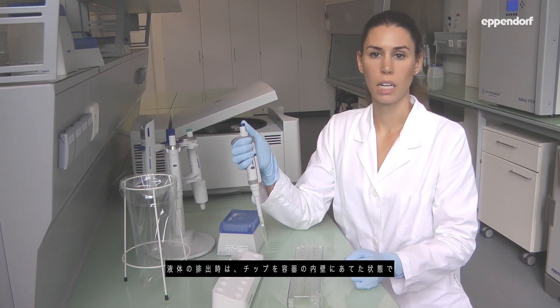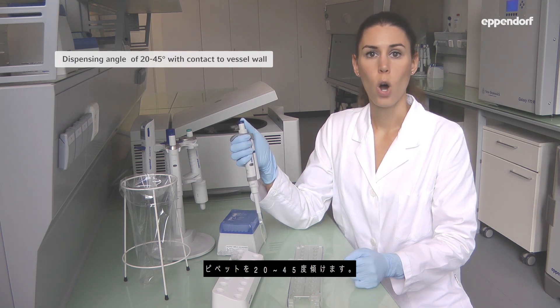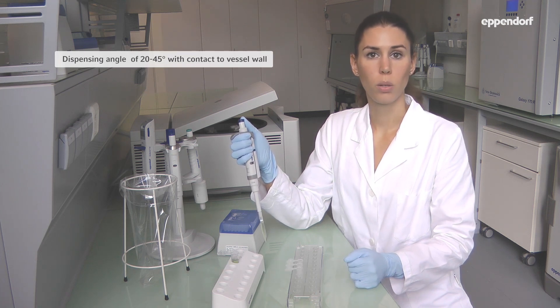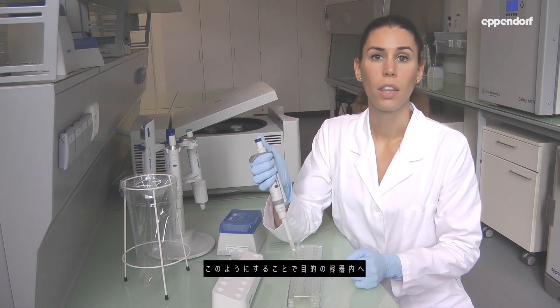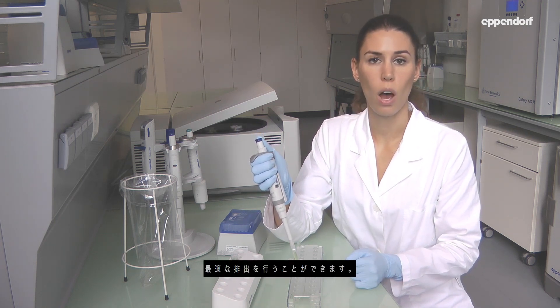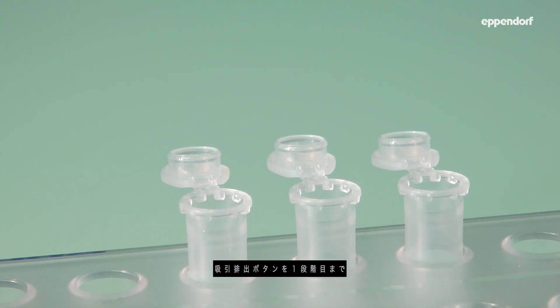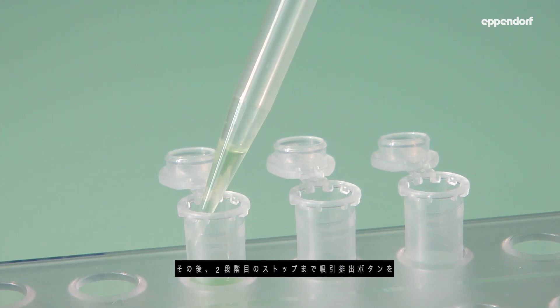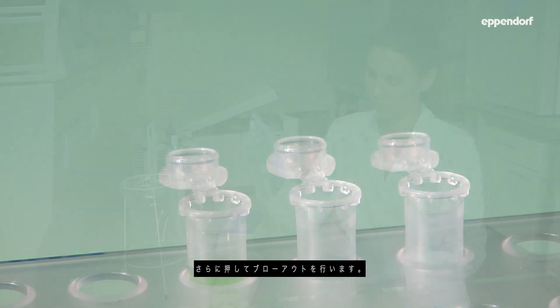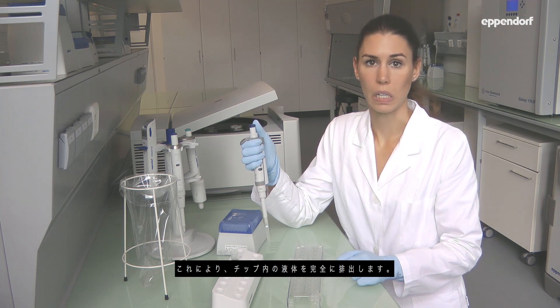When dispensing liquid, the angle of the pipette should be between 20 and 45 degrees, whilst the tip should stay in contact with the vessel wall. This guarantees optimal flow of the liquid into the target vessel. Press the control button down to the first stop, then perform the blow-out by pressing further down to the second stop. This ensures that the tip is emptied completely.